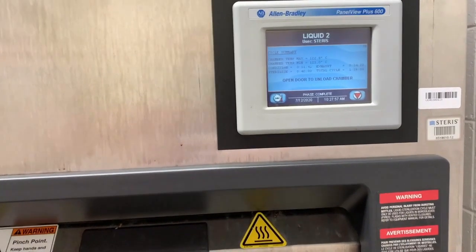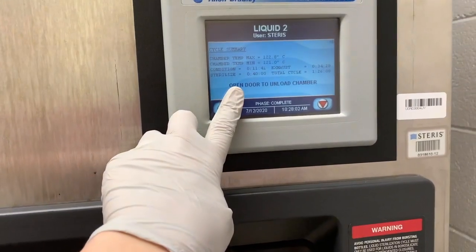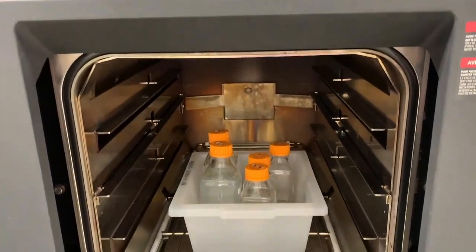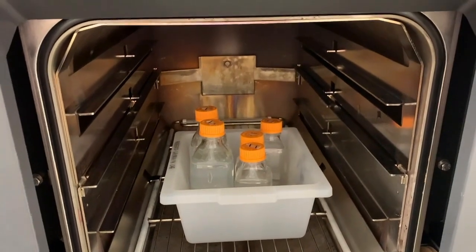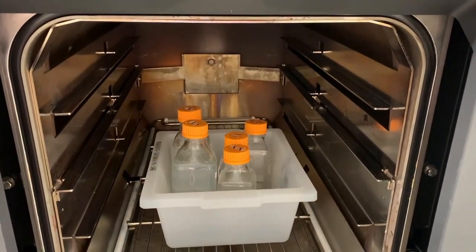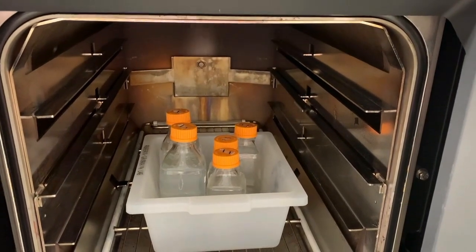So when you come back to your autoclave, you'll see that it's finished, and it will say something like open door to unload chamber. You're just going to pull this door down. You might see some steam come out. And then you'll put on those orange fuzzy gloves like this and pull out your samples. Remember, they have the lids slightly uncapped, so you may want to either be really careful carrying this downstairs or else bring a cart.